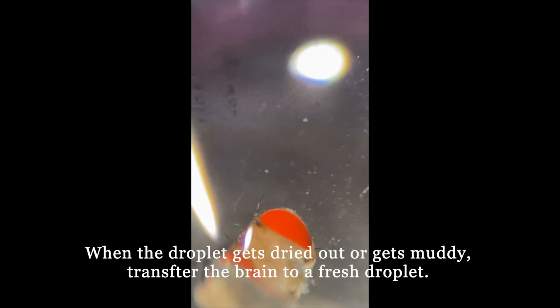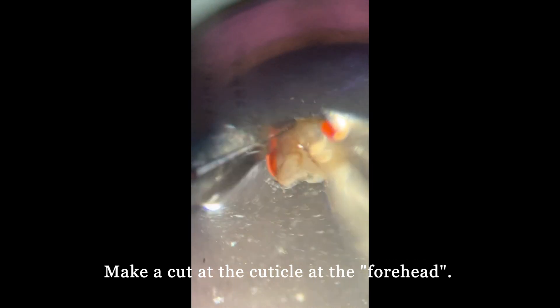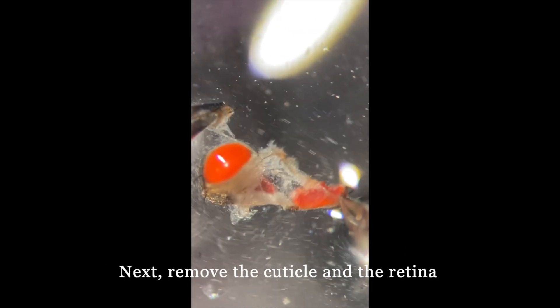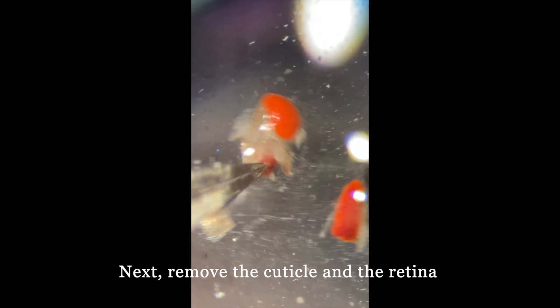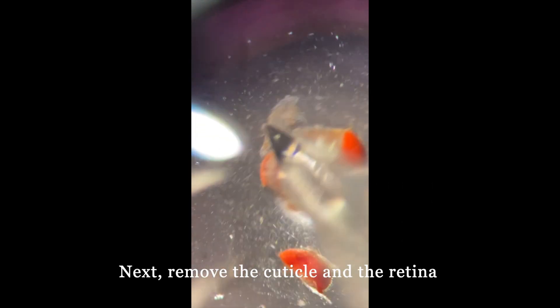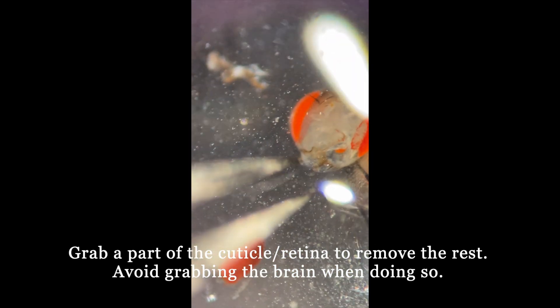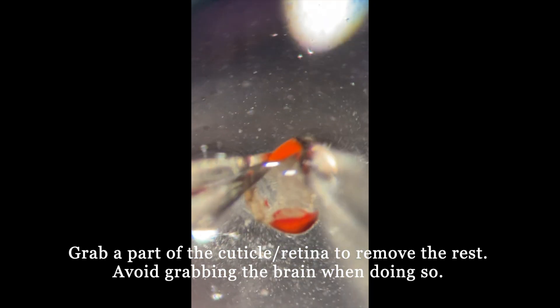Now that we have removed the antennae and the proboscis, we are going to make a cut at the cuticle between the eyes, where we call it the forehead. Then, we start to gently peel off the cuticles and the retina step by step. During this process, we always grab a part of the cuticle or retina to remove the rest. Avoid grabbing the brain when doing so.